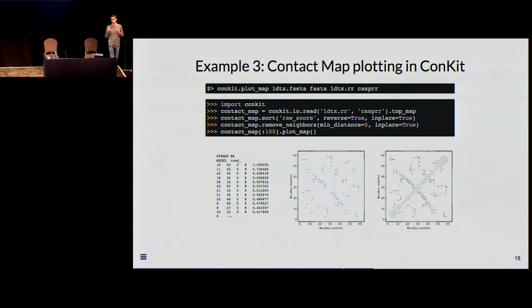Now, if you have some structural information, such as you already have a crystal structure, and you would want to identify functional sites, yet you're not sure how good your contacts are, then you can plot exactly the same, but with reference to this crystal structure.